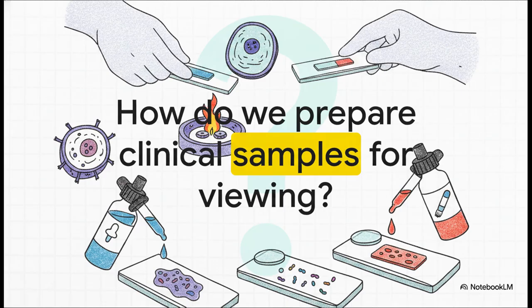But knowing the instrument is really only half the battle. Think about it. You could have a $1 million electron microscope with perfect resolving power, but if your clinical sample isn't prepped correctly, you're going to see absolutely nothing. So how do we actually wrangle, fix, and dye these invisible threats so they don't just wash right off the glass?